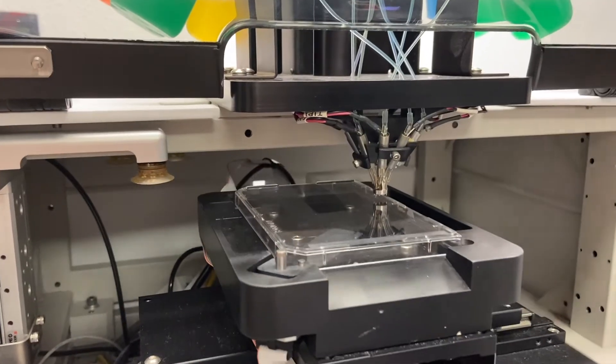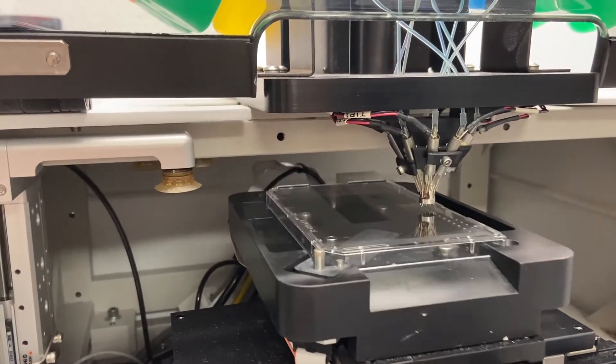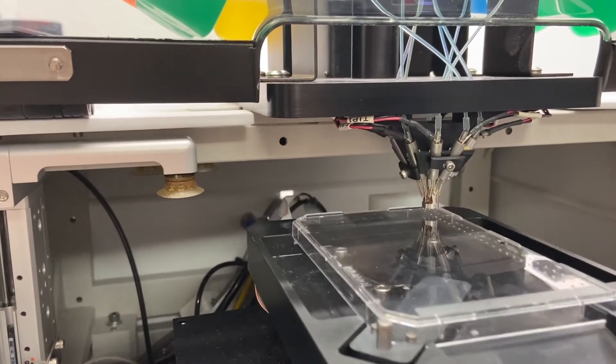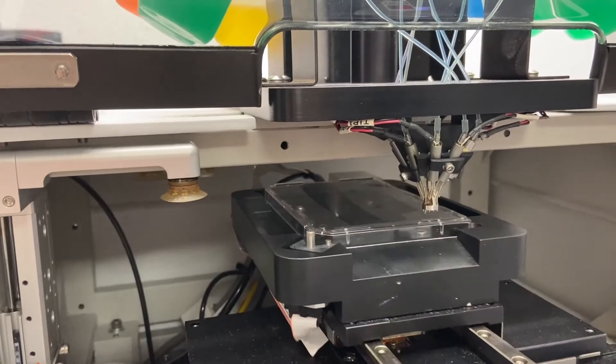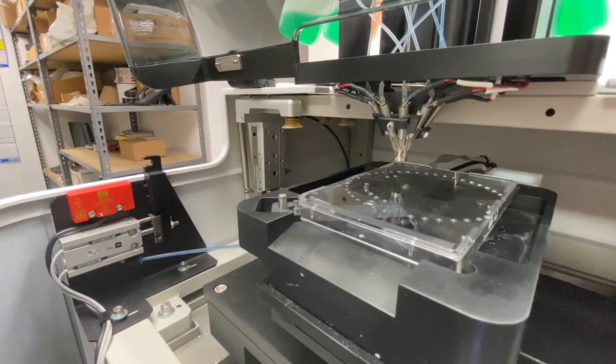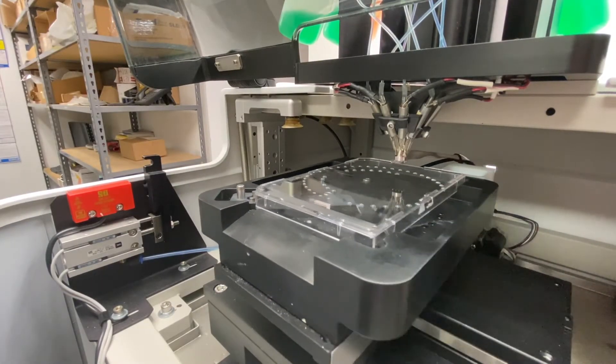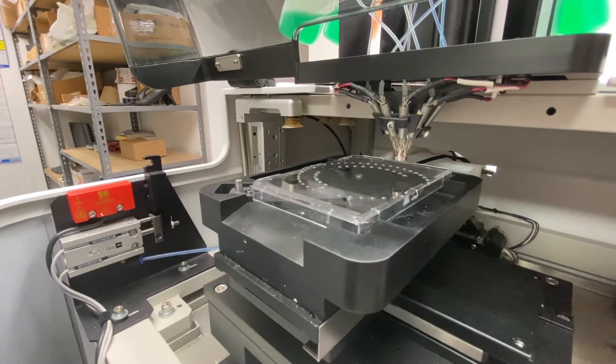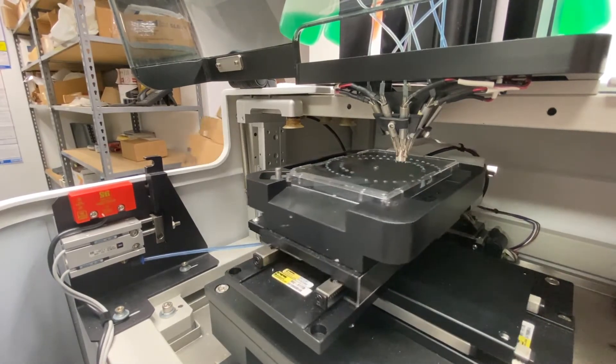Plate types 96, 384, 1536, 3456, and other types or patterns can be set up with advanced dispense CSV files. The new system dispenses on the fly for increased speed.